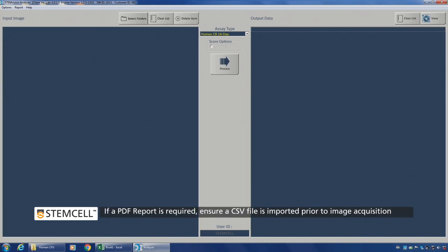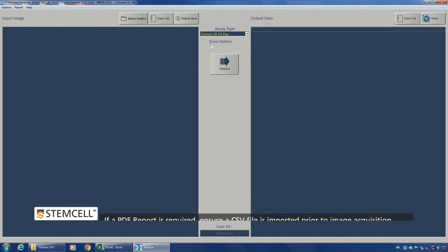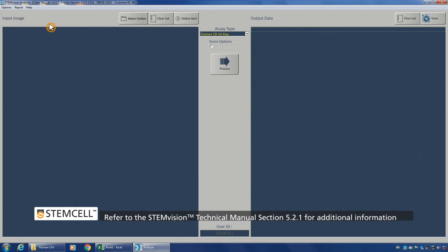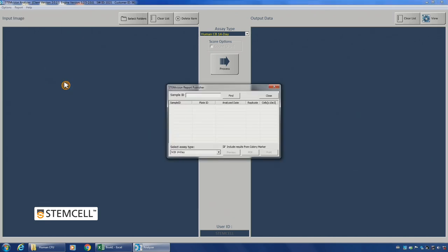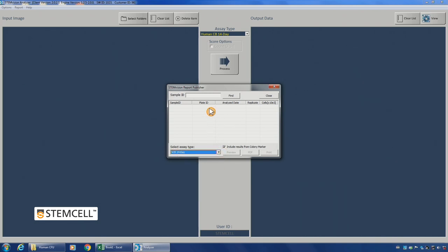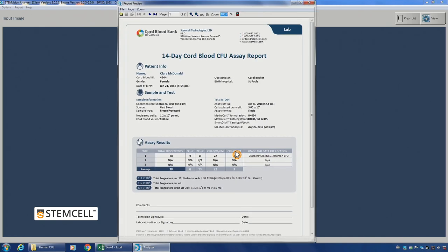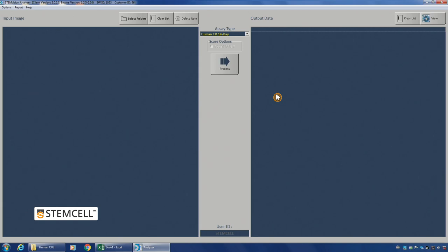Use the STEM Vision Analyzer application to generate a report of the CFU assay results. This is only available if you load a pre-populated CSV file into the acquisition application prior to image capture. In the analyzer application, click on Report. Ensure Autoprint is selected. Select Find. Now choose the appropriate assay type or enter the sample ID to be included on the report. Then click Find. Click the Preview button or PDF to save a PDF version of your report. Click Close once finished.